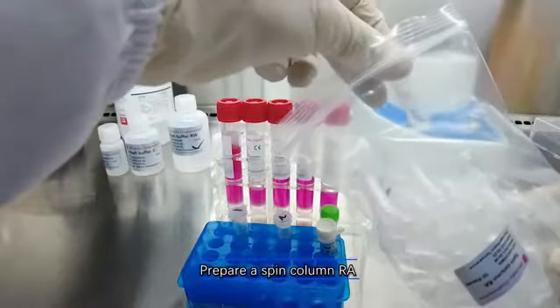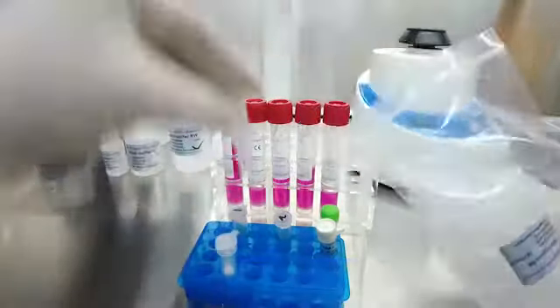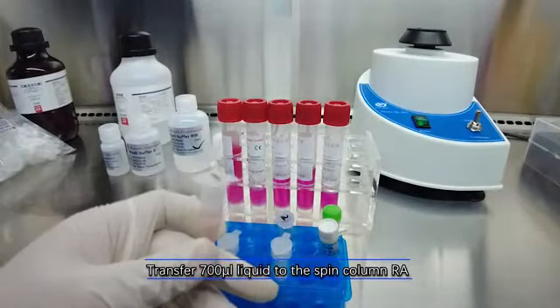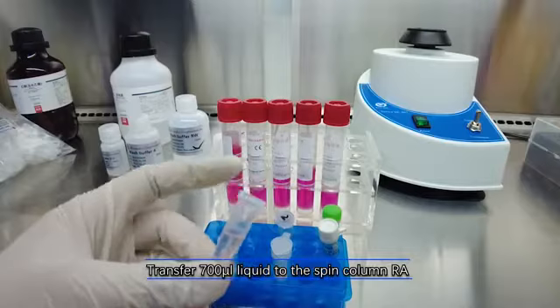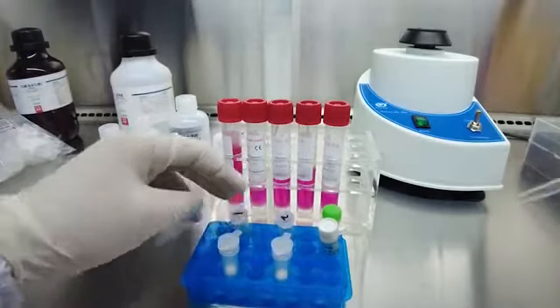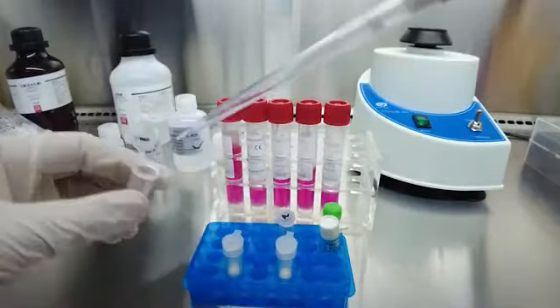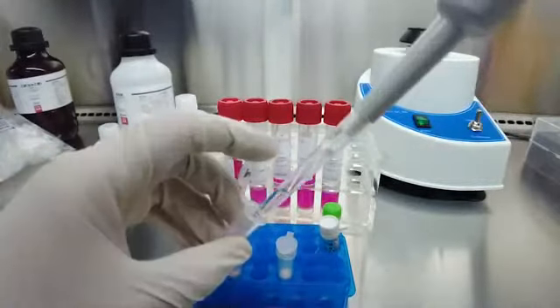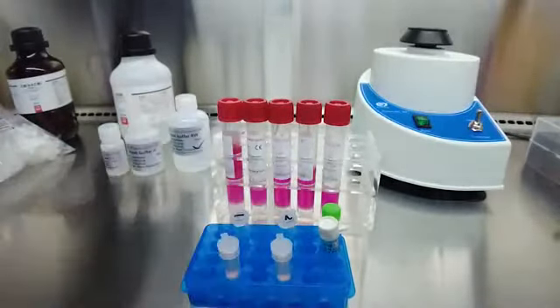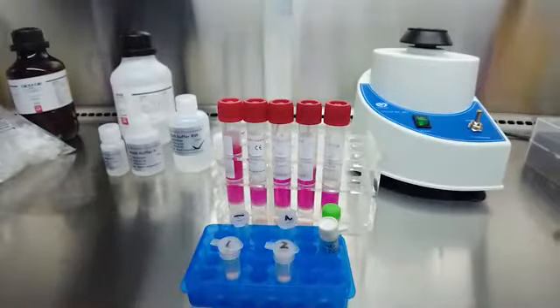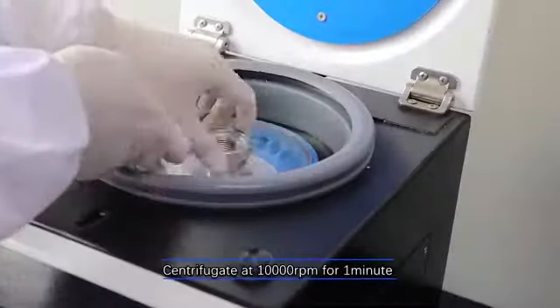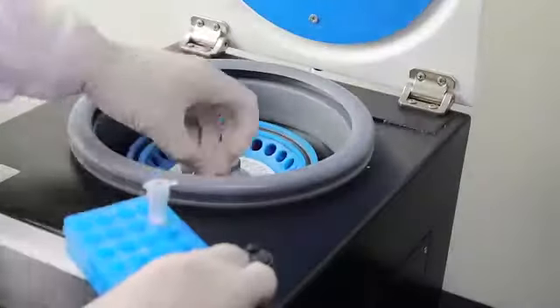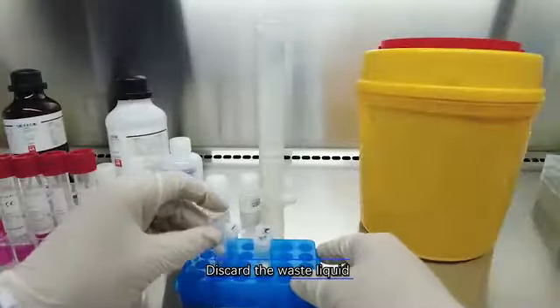Prepare a spin column I. Transfer 700 microliter liquid to the spin column I. Centrifugate at 10,000 revolutions per minute for one minute. Discard the waste liquid.